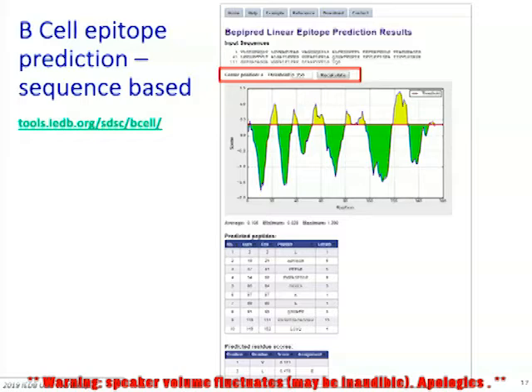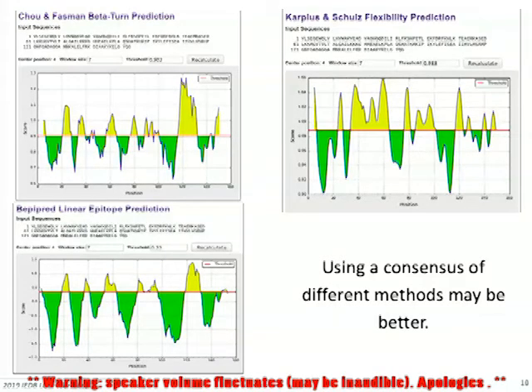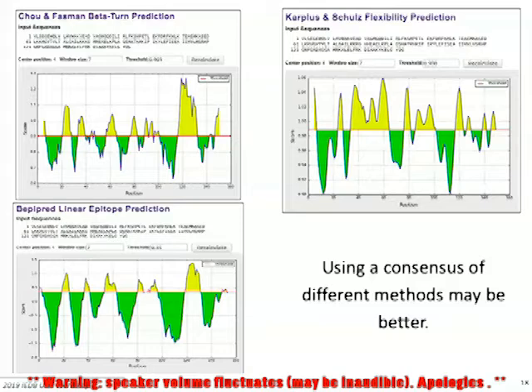And you can adjust the threshold to find different regions whether they change. And compared to the T-cell epitope predictions, the B-cell epitope predictions performance is not so great. There are different reasons for that. First of all, developing a prediction model for B-cell is tougher because there are more factors that influence this, like for example the structure of the protein.